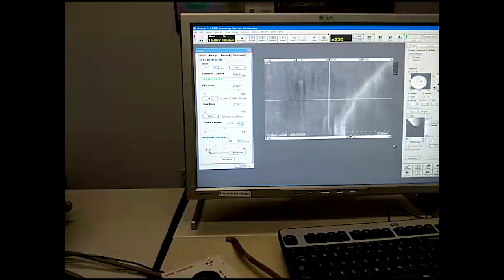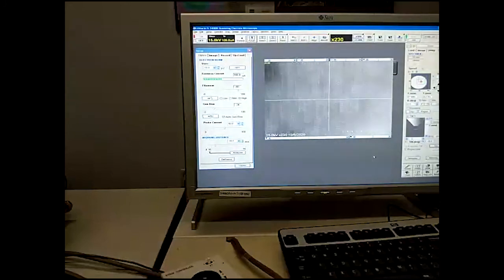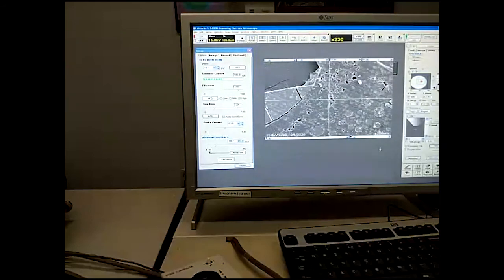And it should sort itself out and bring itself back to the location that it, no, apologies, I didn't unclick this. Let's try that again. Keep it on eccentric, put it back to 0, click go. And there you are, you have yourself back where you started from.